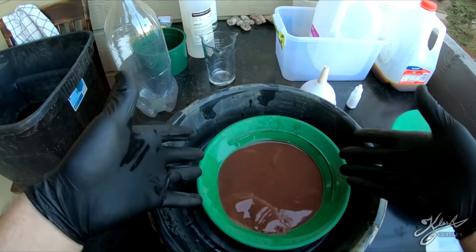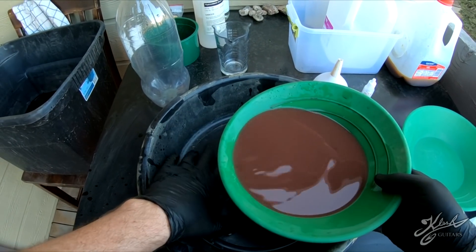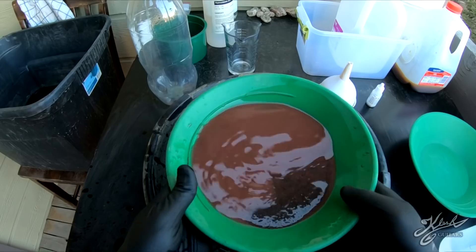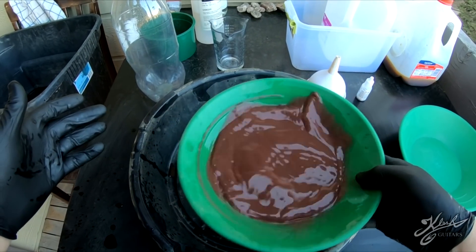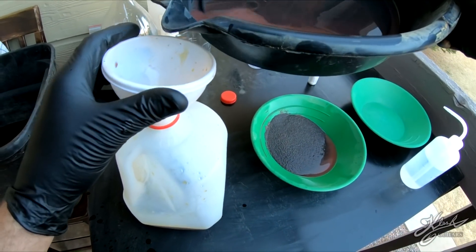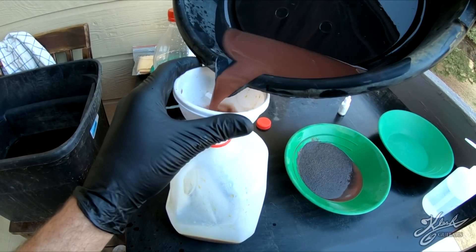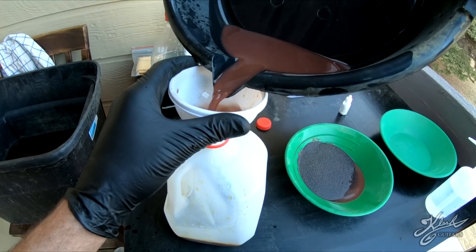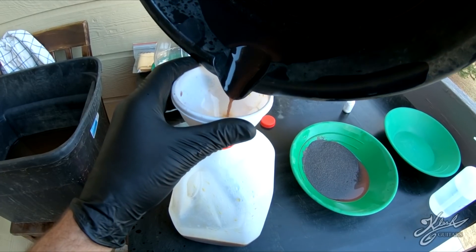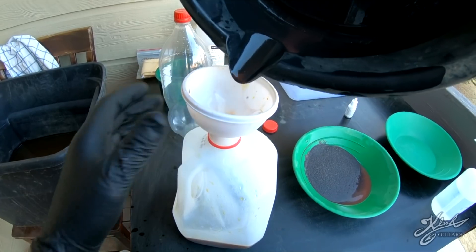We're going to do all of our panning in this - this is my mercury bin. I'm going to fill it up with a little bit of water and then pan this out as we normally would until we get to the mercury. I'm going to use some fresh water and dump this water right into our mercury waste, because there may be a little bit of mercury still in there.